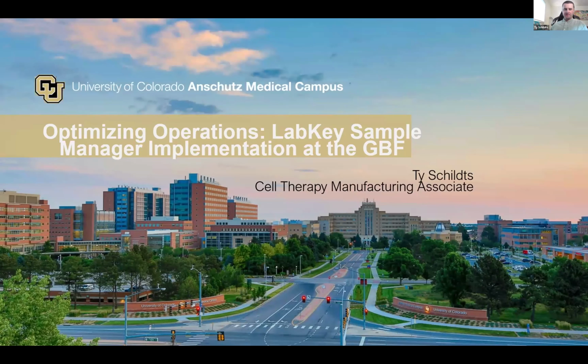I am a cell therapy manufacturing associate at the Gates Biomanufacturing Facility on the University of Colorado Anschutz Medical Campus in Aurora, Colorado. Today I'll be talking with you about how we came to bring LabKey Sample Manager into our lab. We actually had a previous freezer inventory software, so unlike some labs that don't have an existing system, we had one and ran up against a roadblock where we recognized we were going to have to switch and move that system over. I'm going to talk about what that timeline looked like, and how we've been using Sample Manager since.